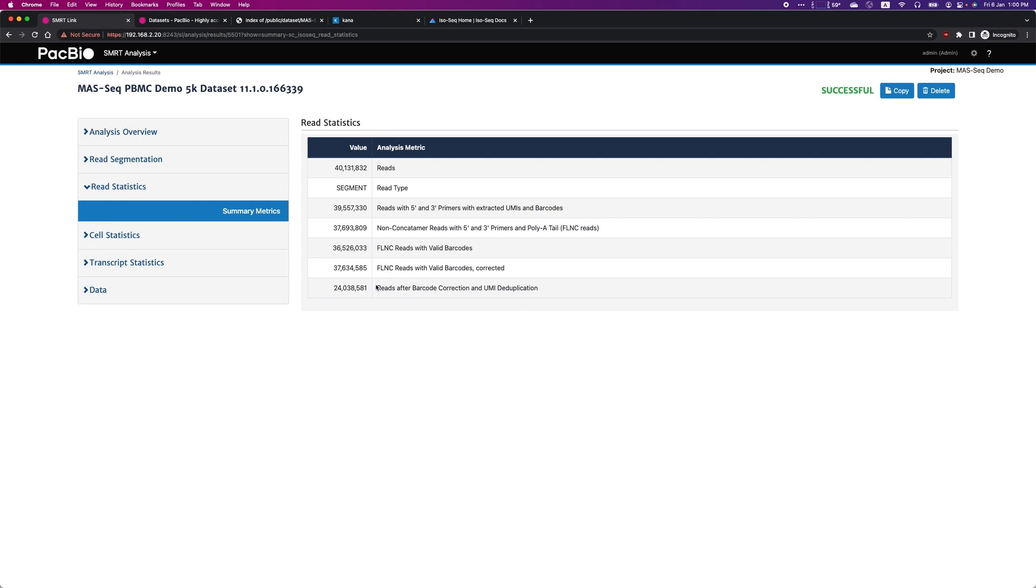The last row contains the number of reads after deduplicating using UMI, the percentage of which will depend on the number of cells, sample type, and sequencing depth.